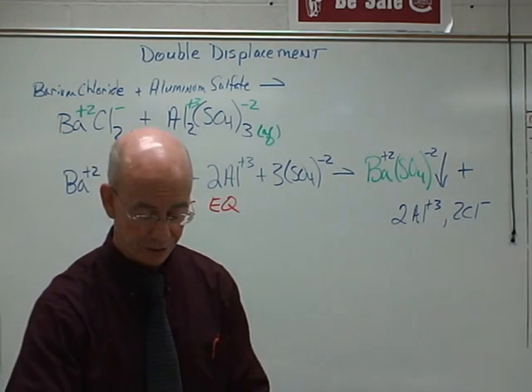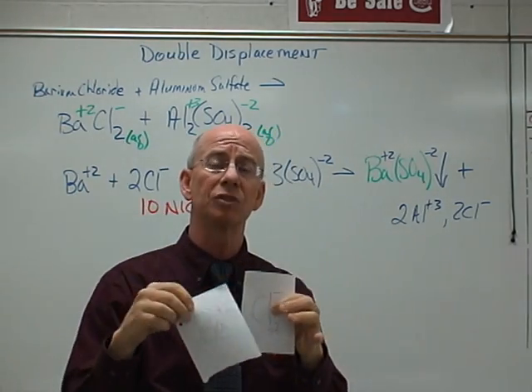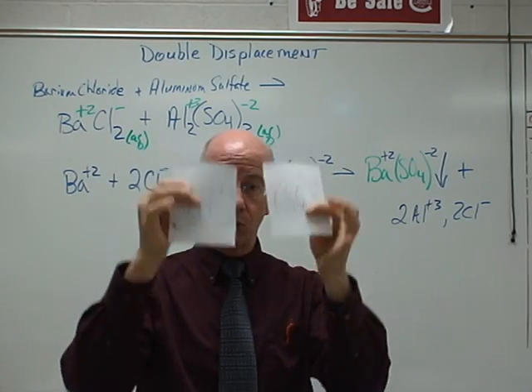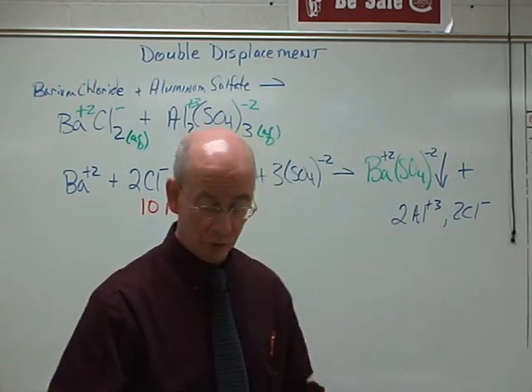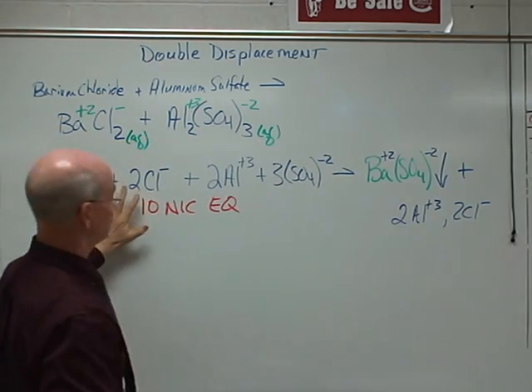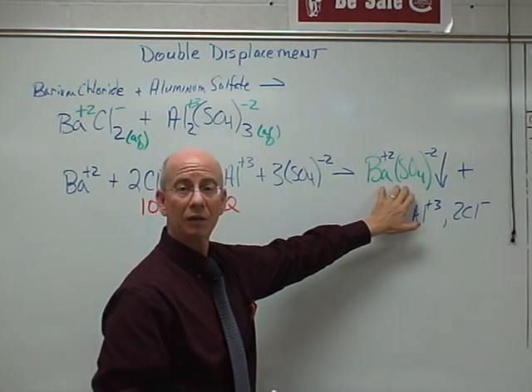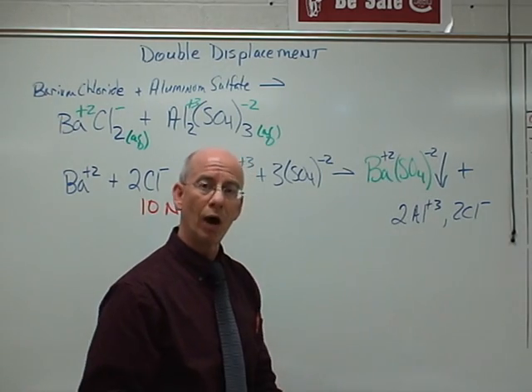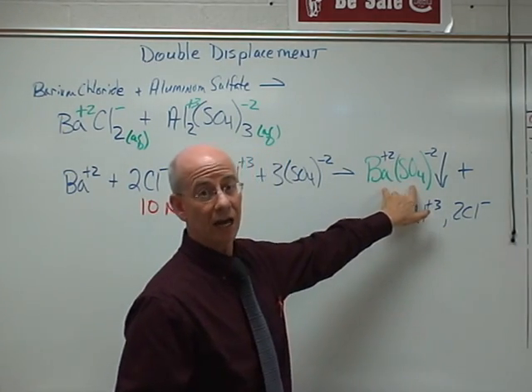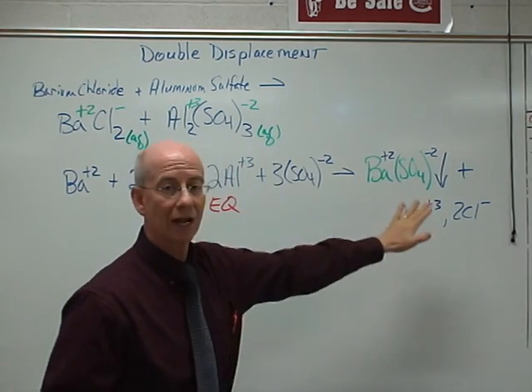That should make a lot of sense. We took our original compounds, we put them in water, and they became dissociated into ions. Same thing with the other. Put it in water, they dissociated into ions. So we wrote those ions out. When we mix these two, this was in one beaker, this was in another beaker, when we mixed them together, we got a white precipitate and still water, which had these in it. So we see again, these are not ions. This is a compound, but these are still ions. So the overall reaction now looks like that.